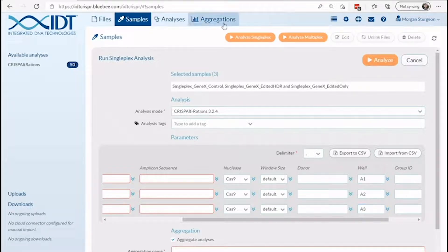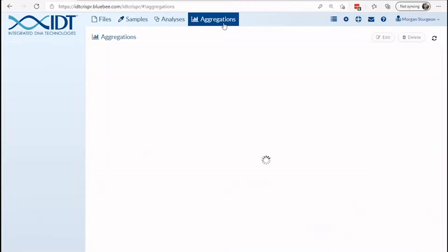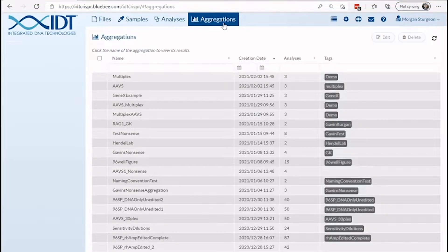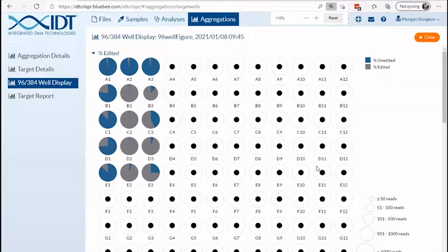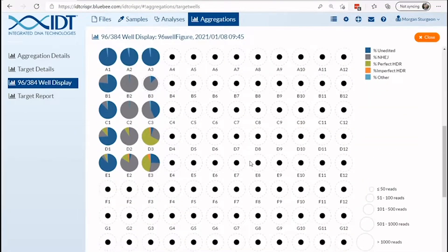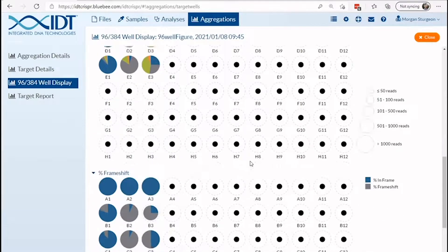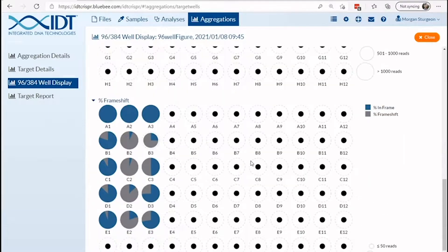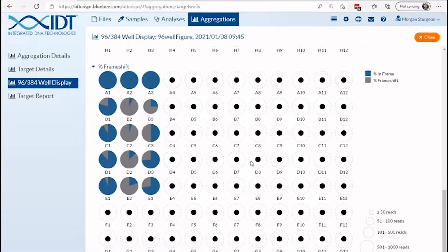Once your run is complete, under the aggregations tab you can quickly find graphics that give frequencies of editing, repair pathway utilization, and frameshift frequency.